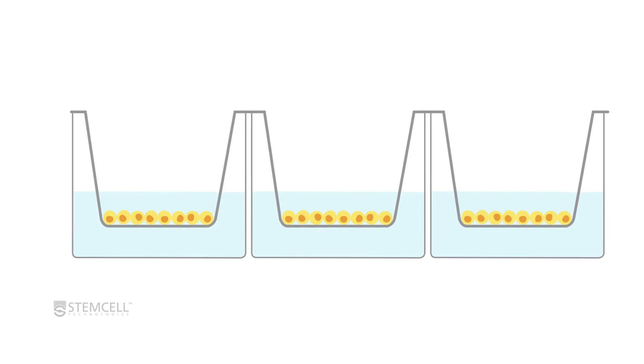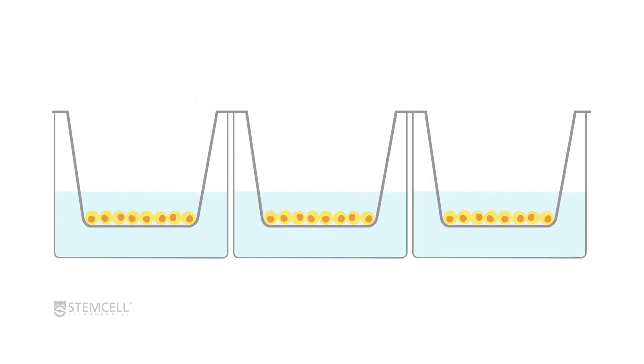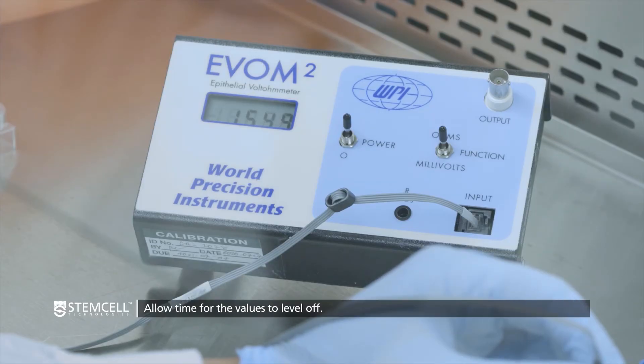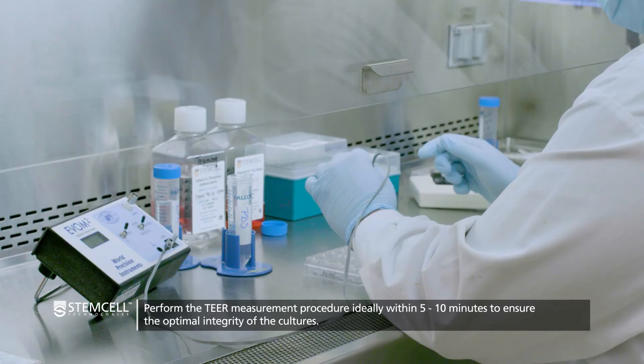Perform a TEER measurement on an ALI culture by inserting the long prong of the probe into the break in the transwell hanger, lowering it until it touches the bottom of the well. The short prong of the probe will rest just above the surface of the ALI culture. Be sure to keep the probe at a 90 degree angle while taking the measurement. The OHM values on the EVOM screen will steadily drop — wait until the values level off for a moment before recording the value.